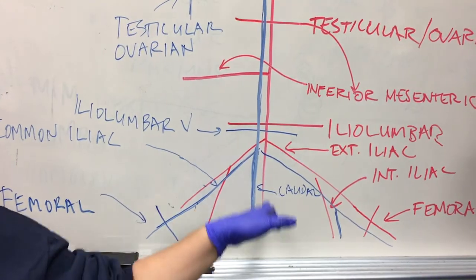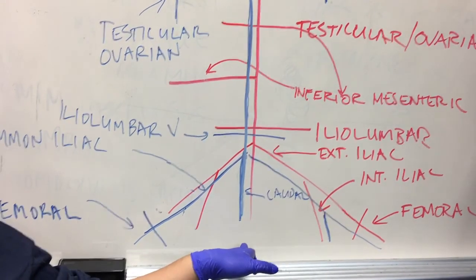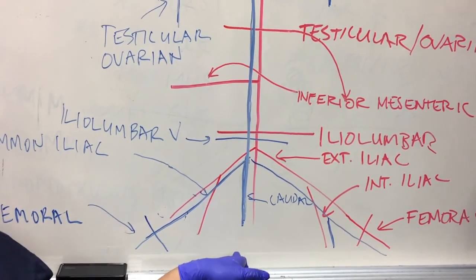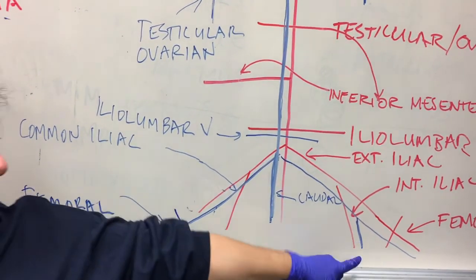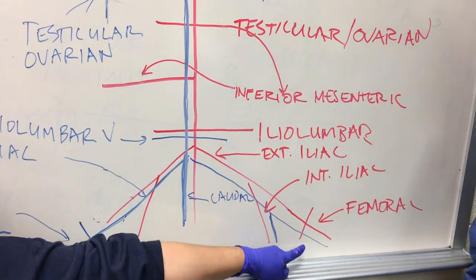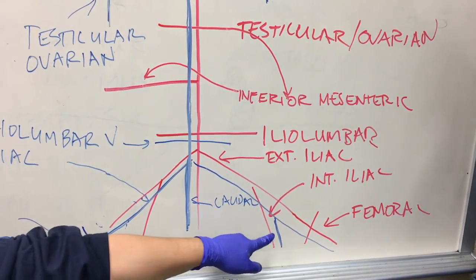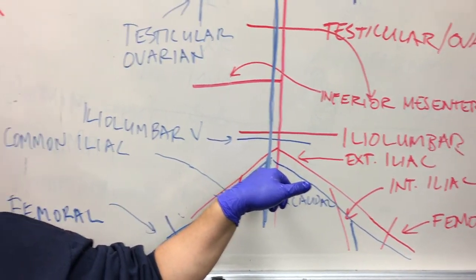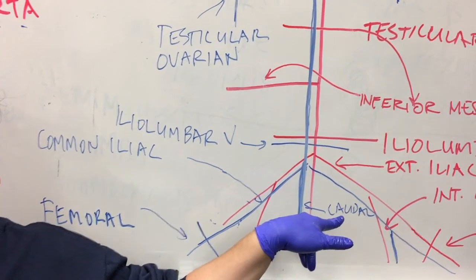I forgot the artery going to the tail. This is the caudal artery. It has a mirror caudal vein that's coming from the tail. Coming from each of the legs, we have a femoral vein. Once the femoral vein hits the plane of the abdomen from the leg, we have the common iliac vein. Okay, so those mirror our external iliac arteries.